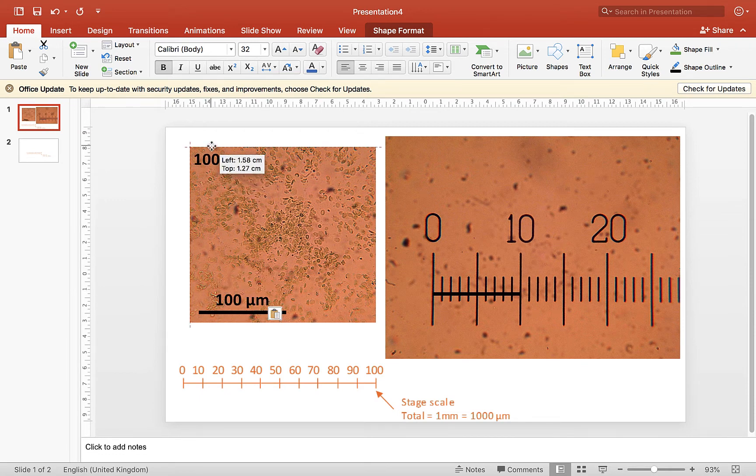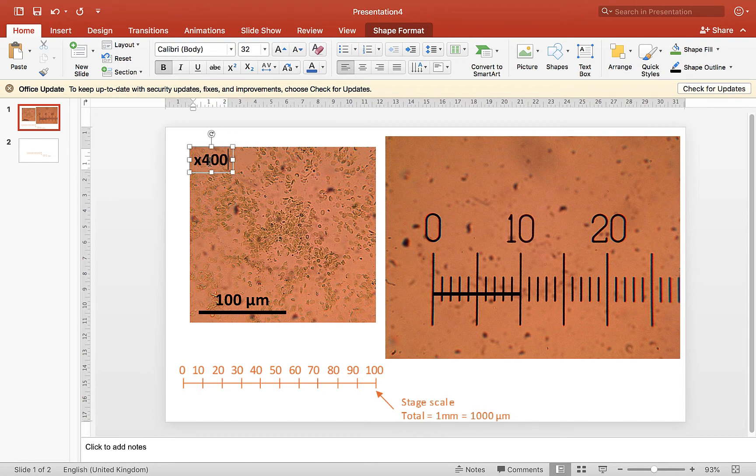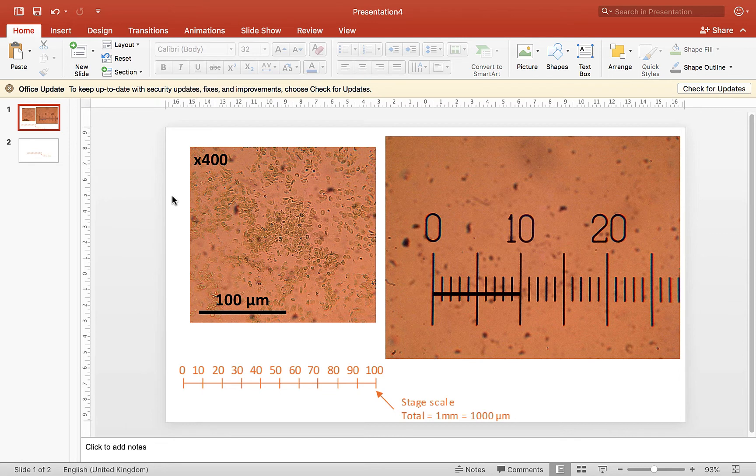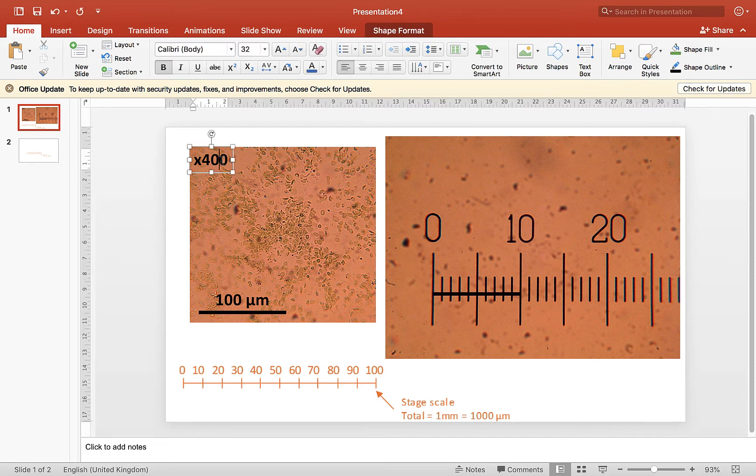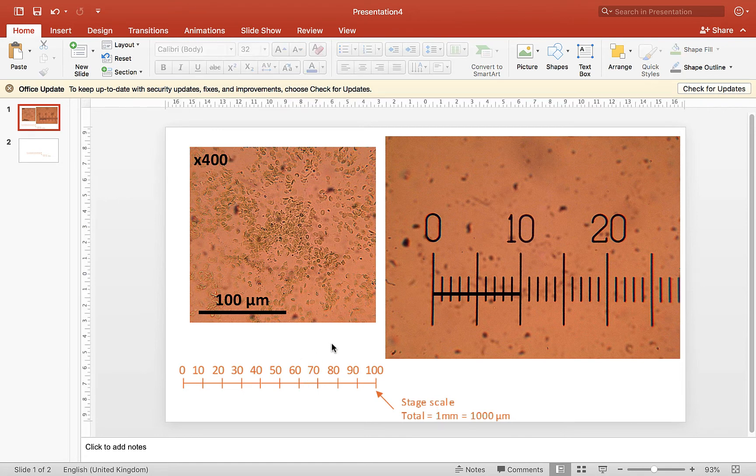The other thing that I need to do is to put the total magnification in the top right hand corner. So as I say, this was taken with the times 400 objective lens, sorry, the times 40 objective lens, and then we've got times 10 in the eyepiece as well, so the total magnification is 400, and that's my image.